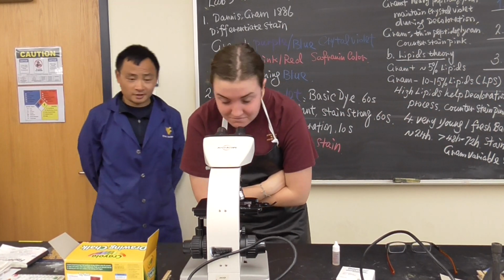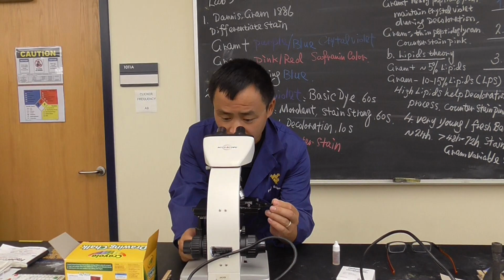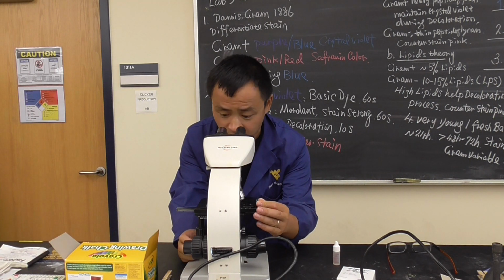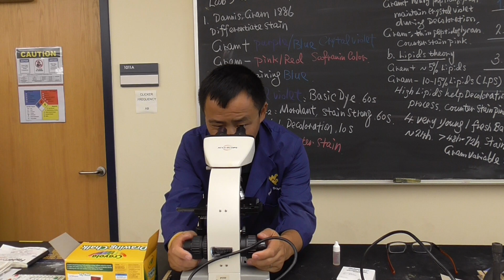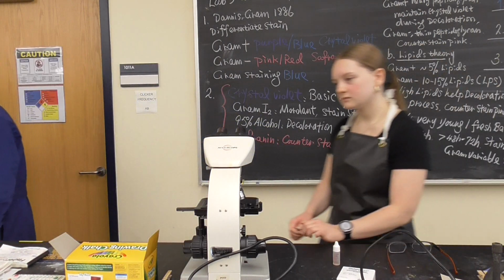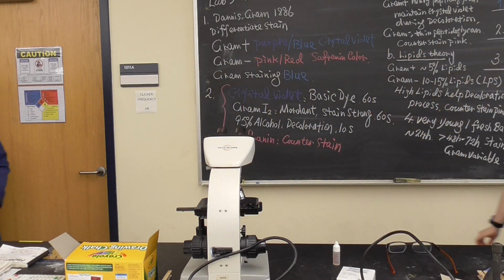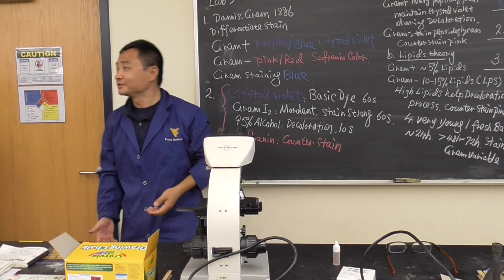Looks good? Yeah? Okay, now let's see lactobacillus. That's the only question. Usually you go the other way. Does gram-positive bacteria become gram-negative? That could be because gram variable still. We'll see the last one. Okay. The last one, what it looks like. Surprisingly, the lactobacillus also looks like Staphylococcus aureus. So let's come here to see it. And that's fine. We'll see what it looks like.